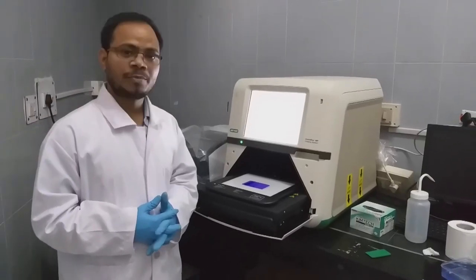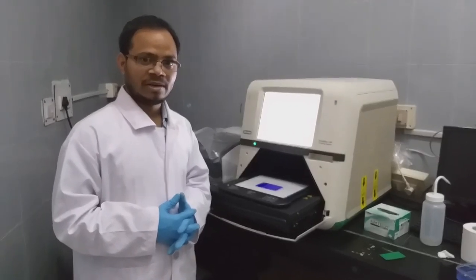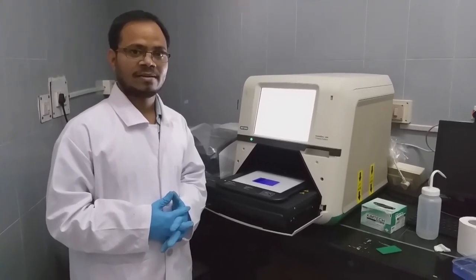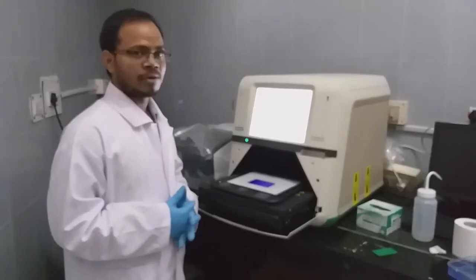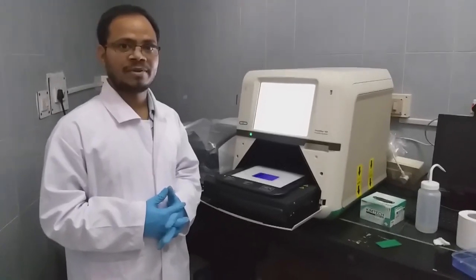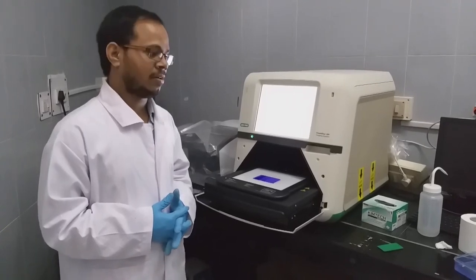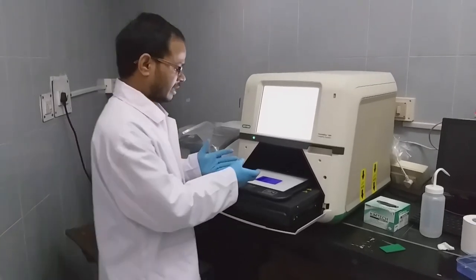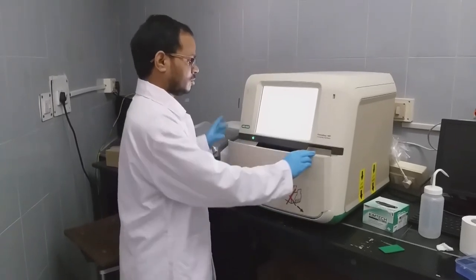So we purified the protein using the nickel NTA column. We ran the gel and stained and de-stained it. So now it's time to document the gel. We have to identify whether we got any single band fraction or not. So this is the gel I kept on a white tray. Now just close it.